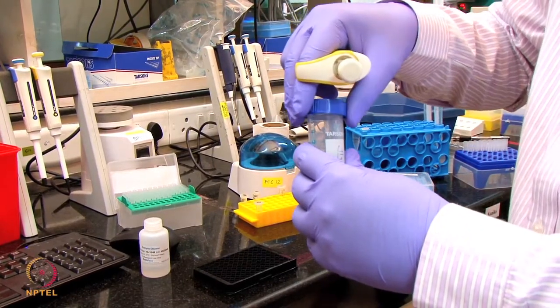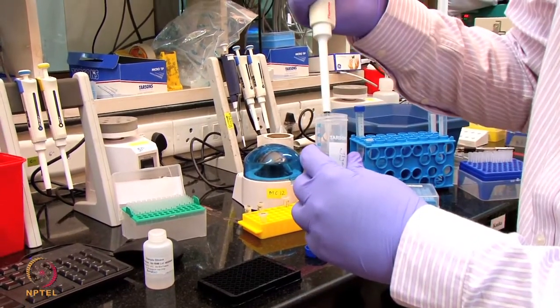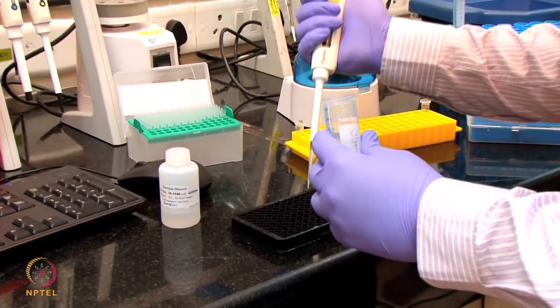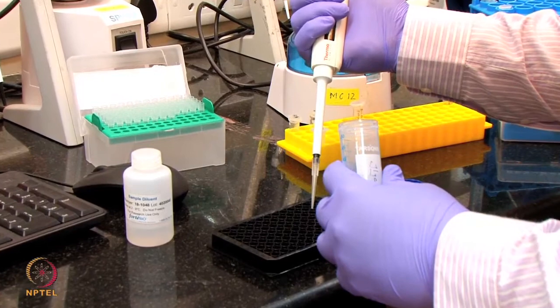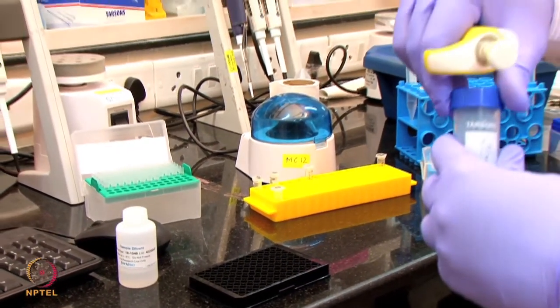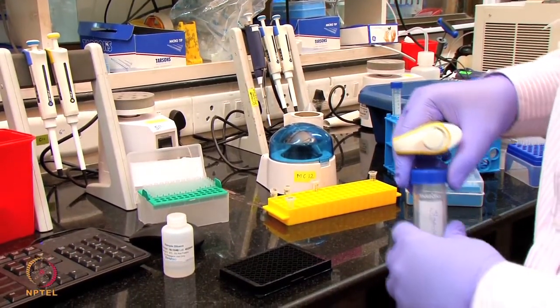This is used for the regeneration of the sensor. So the regeneration buffer I'm going to place at the A11 and the B11. So the bound apolipoprotein will be washed when the sensor dips into this acidic buffer.